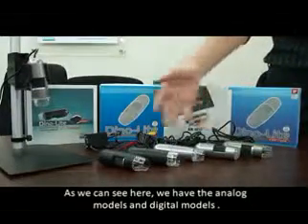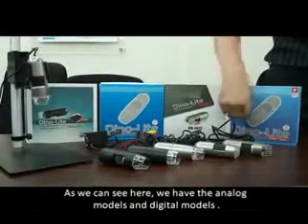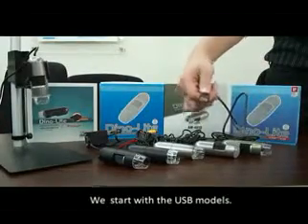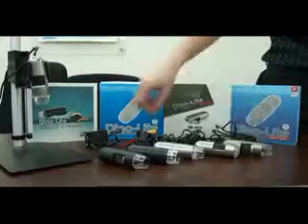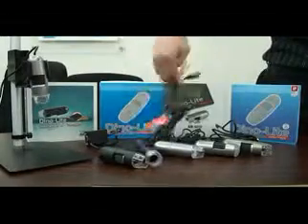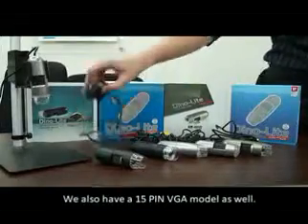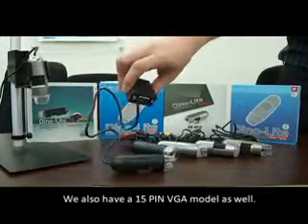As we can see here, we have the analog models and digital models. We start with the USB models. This is our CA connection as well as power connection. We also have a 15-pin VGA model as well.